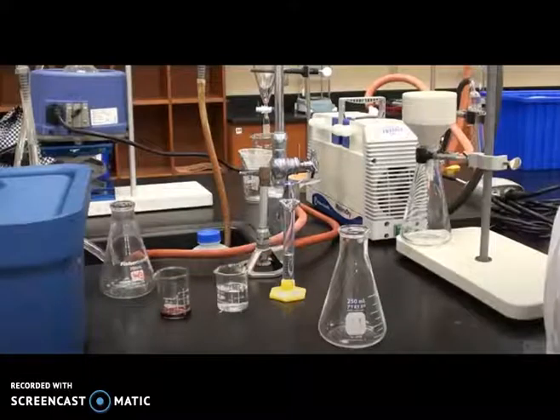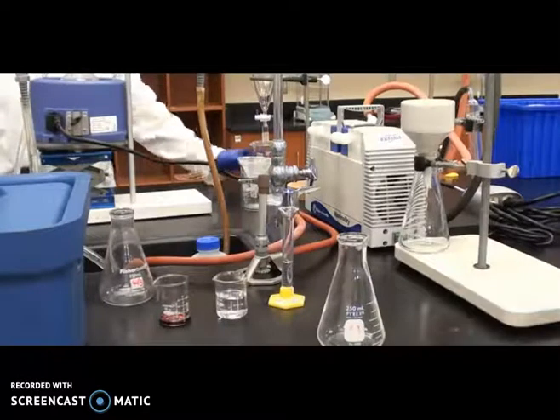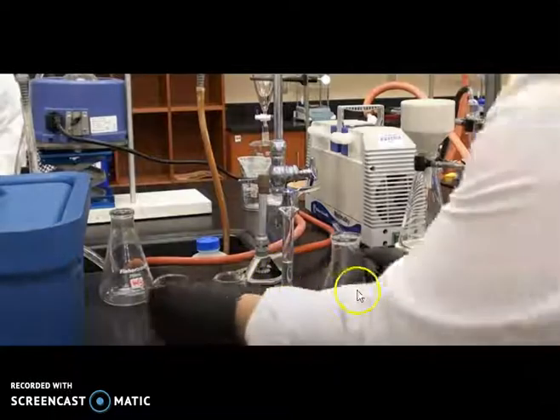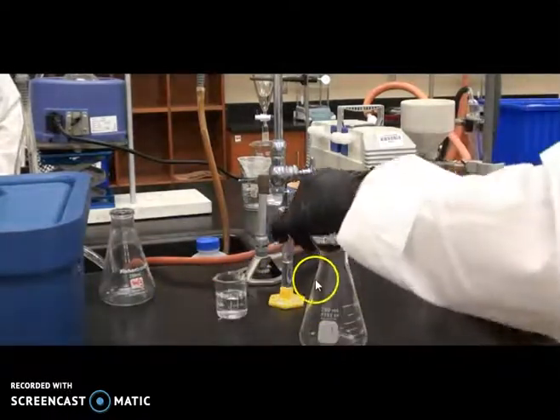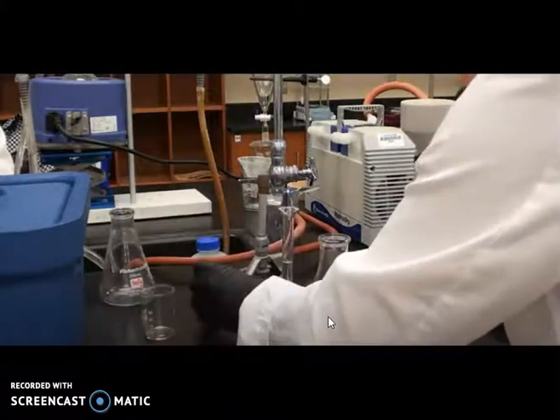Now you can see this is the setup of the experiment. You can see here, this is the flask, these are two beakers. Here for filtration you have a Buchner funnel. That's just DI water, and then the other one we're going to see. And you have to add here aniline with the water.